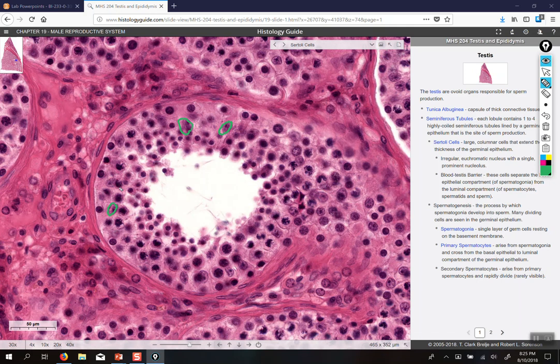Okay, so that is testis stuff, and here we can see another spermatozoan. These little guys are all going to be, of course, spermatids. Remember, spermatids haven't necessarily undergone spermiogenesis yet, so they are still circular. They undergo spermiogenesis to form a head, midpiece, and tail, and that's what you're seeing in the lumen here. Okay, so that was ovary and testis, which we saved for later.